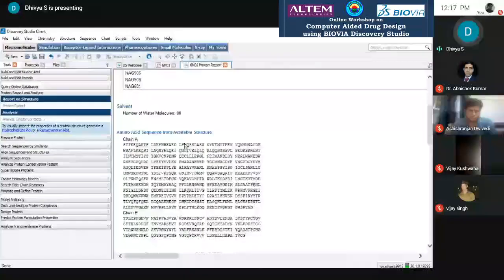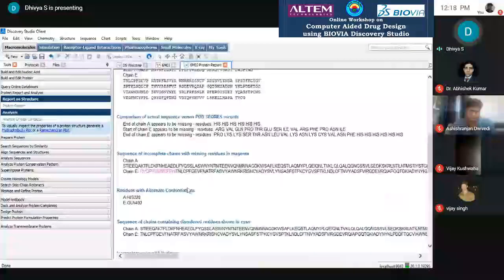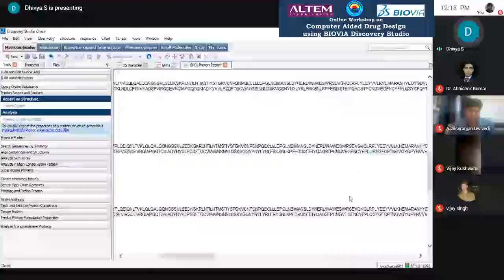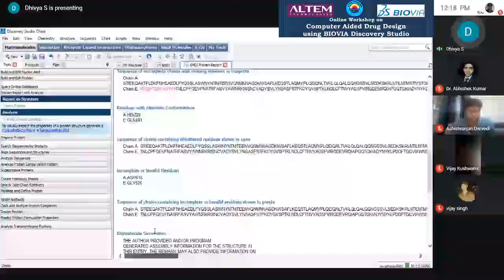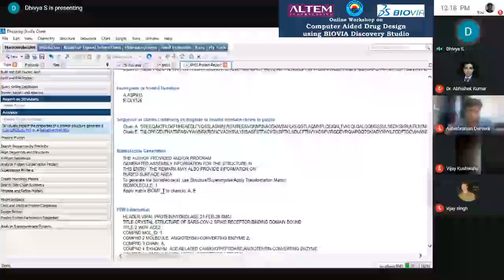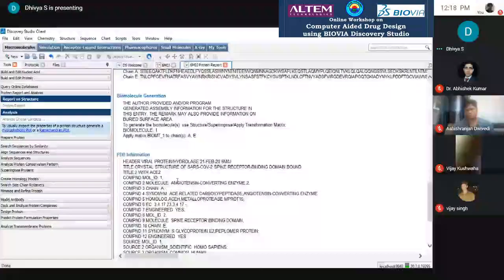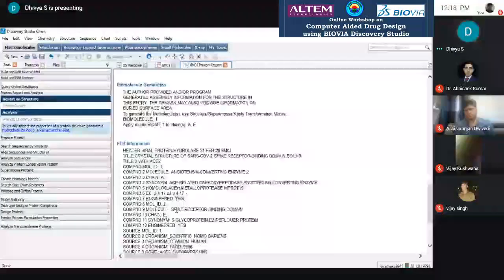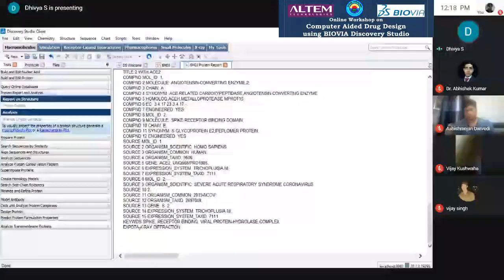The report shows the A chain and E chain, any spurious data or missing groups, incomplete chain residues, alternate conformers, invalid residues and their locations and amino acid identities. You will also see biomolecular generation information and PDB information — for instance, that this is the spike protein receptor-binding domain complexed with ACE2 (angiotensin-converting enzyme 2). Information includes the EC number, enzyme number, and source organism. Now I am going to work only on the E chain — select the E chain and discard the other chains.